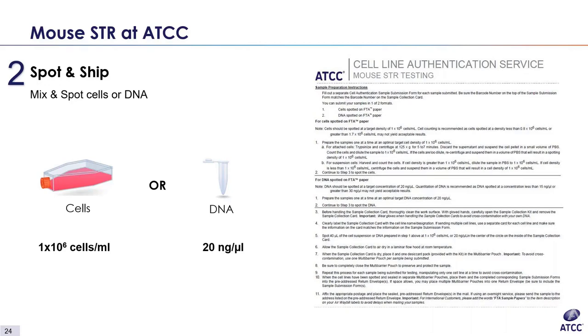Once the sample is at the optimal spotting density or concentration, it is very important to mix thoroughly prior to spotting on the card. Subsequently, the cards are left to dry at room temperature and then placed in the provided multi-barrier pouch for shipping back to ATCC.